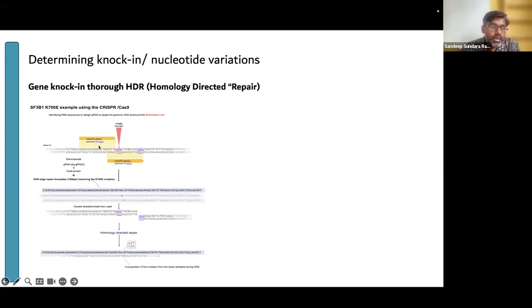If I'm using CRISPR Cas9 to generate a double strand break, and then providing a donor template, but only changing a single nucleotide at a particular location, say my nucleotide is a G at that point, I would like to substitute it with a C, with an A, and with a T. That is completely achievable by providing three different HDR templates during the experiment, which then allows me to recombine at least one of them at that particular site.